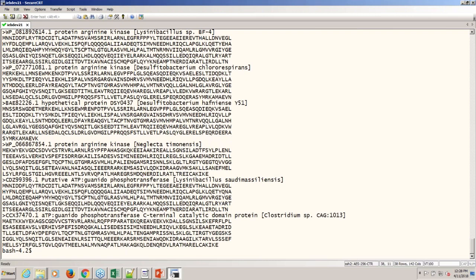Okay, and that's basically what I wanted to cover today. There is an infinite number of things that you could do. Certainly there are much more sophisticated things you can do if you want to get into parsing output. If you really want to parse output, you should probably parse one of the structured formats. But this is a real simple thing. These are simple things you can do with that tab delimited output. Once you have it on your computer and you have these additional tools to work with, you can do pretty much anything you want with it anytime you want to.